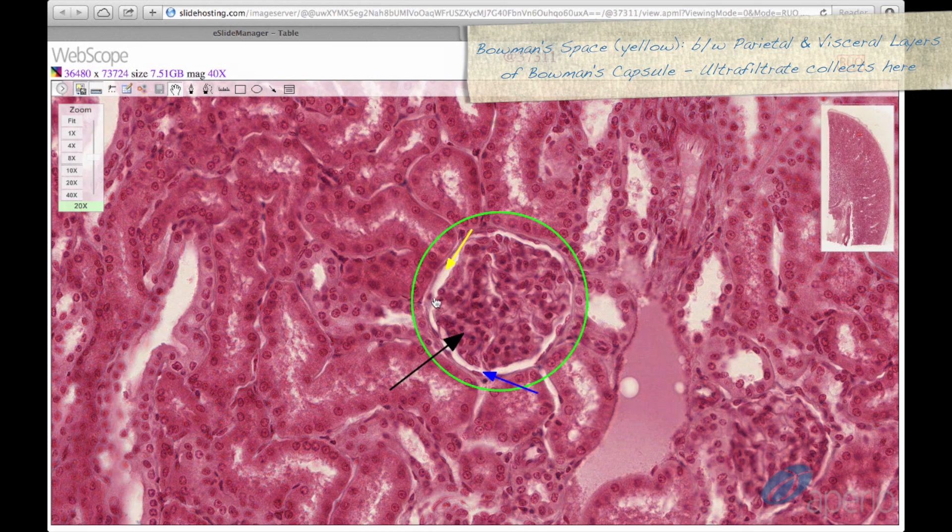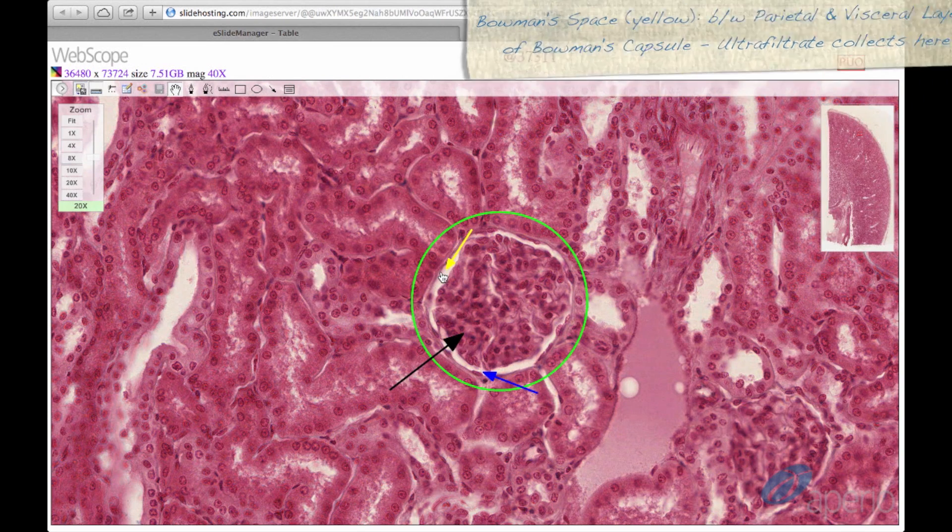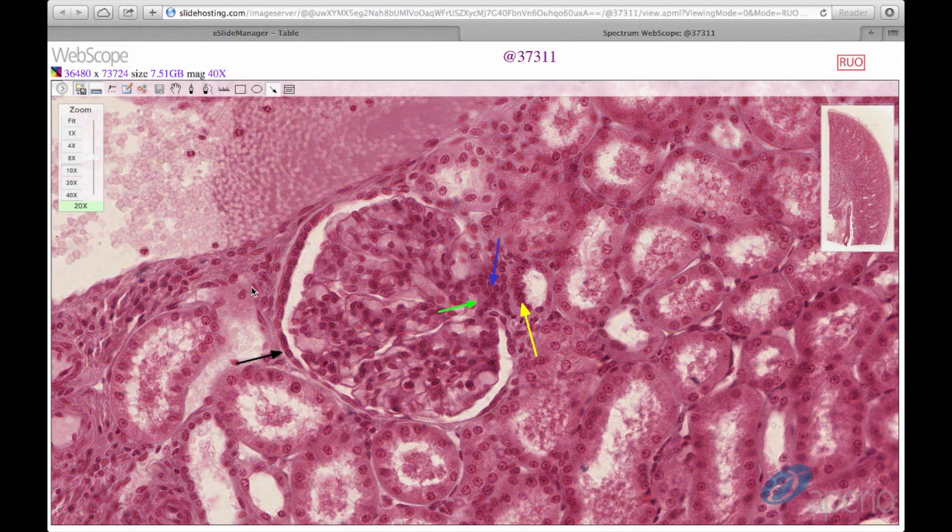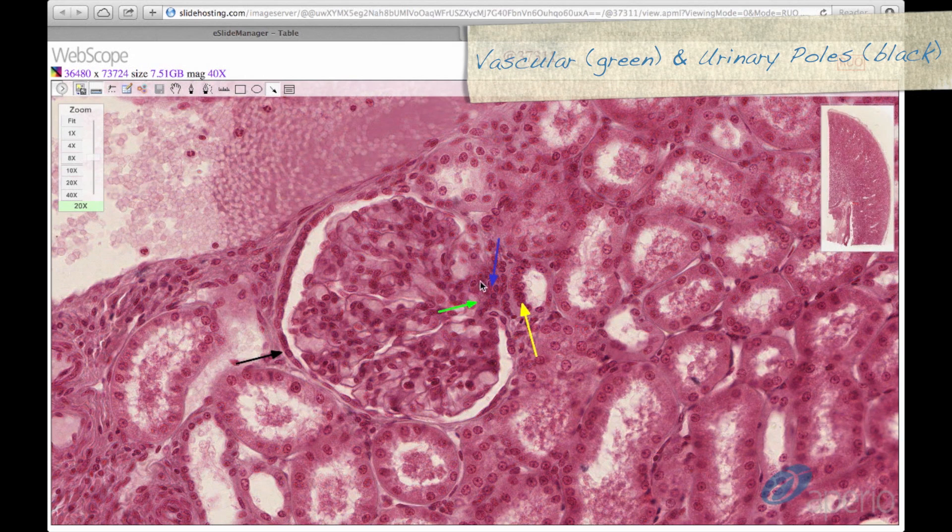Bowman's space is located between the parietal and visceral layers of Bowman's capsule and is the collection point for ultrafiltrate. We have moved to a different section to better visualize the vascular and urinary poles of the renal corpuscle. The renal corpuscle has a vascular pole at the green arrow and a urinary pole opposite the vascular pole at the black arrow.